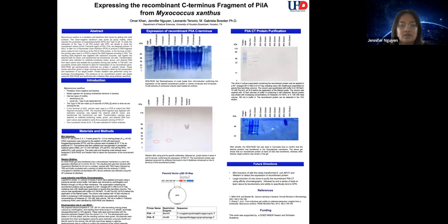So our next step was to do a large induction of PilA-CT4 and PilA-CT6. We started by inoculating a large quantity of LB and induced protein production with, as Leonardo stated earlier, IPTG. This induces beta-galactosidase activity in bacteria to detect LAC gene activity in cloning.